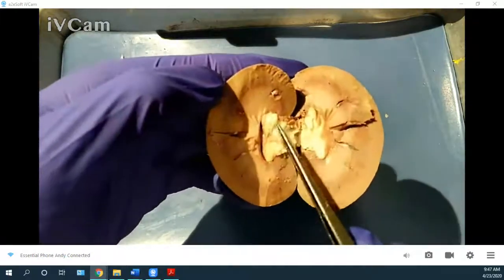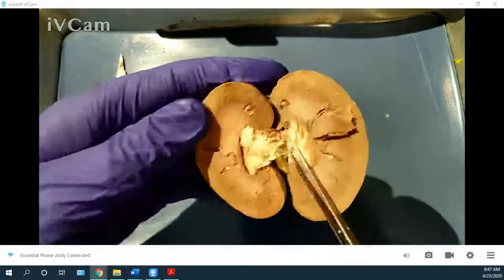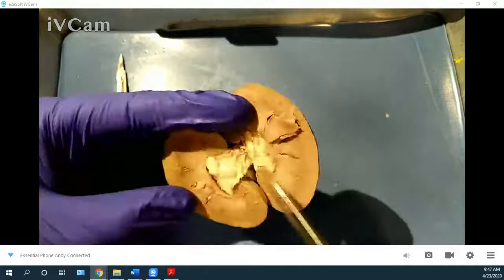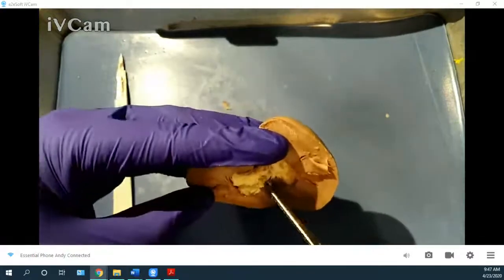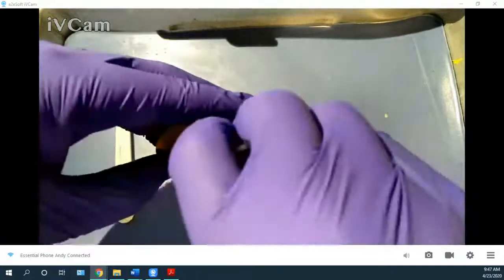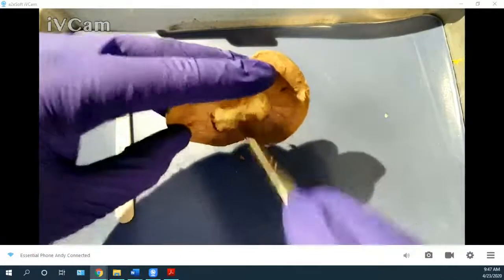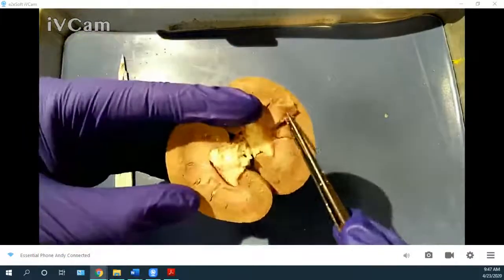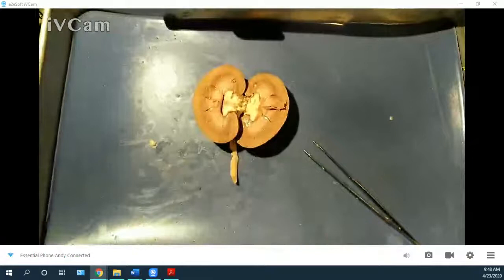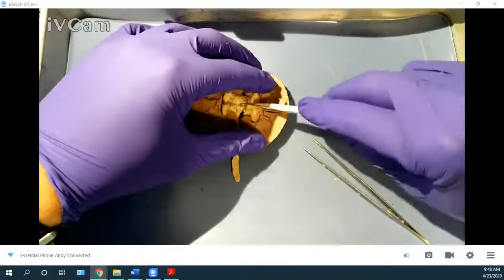If we took all this fat out, you'd start seeing a little bit more of the entrances, the arteries, and the veins in your ureter. Maybe we can get in there and get into the tube and actually go through it. There we go. So you can see the tube there, and such. And then if we make one more cut, just to see what a cross section might look like.